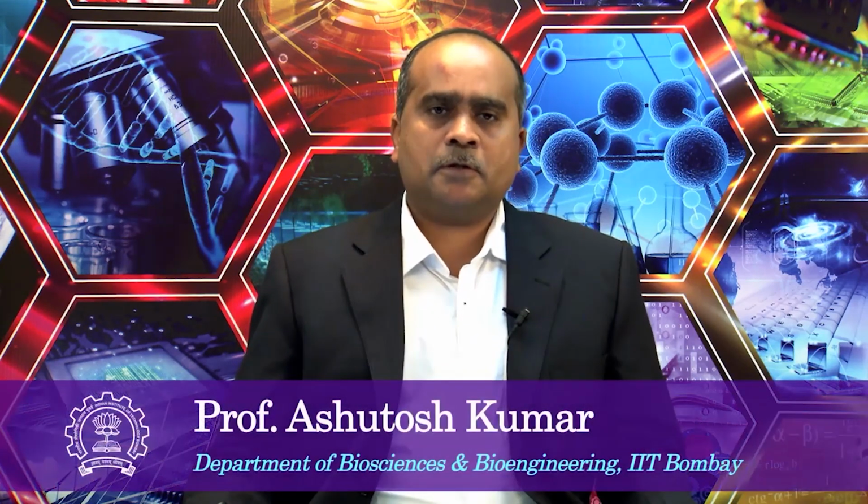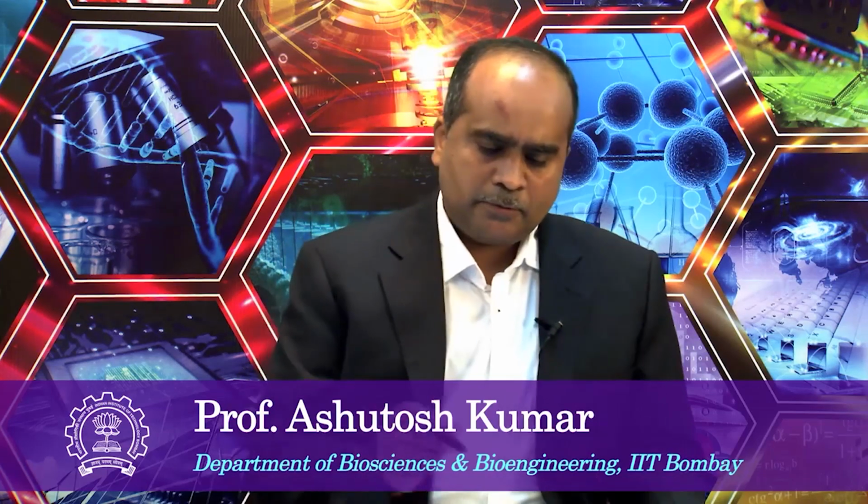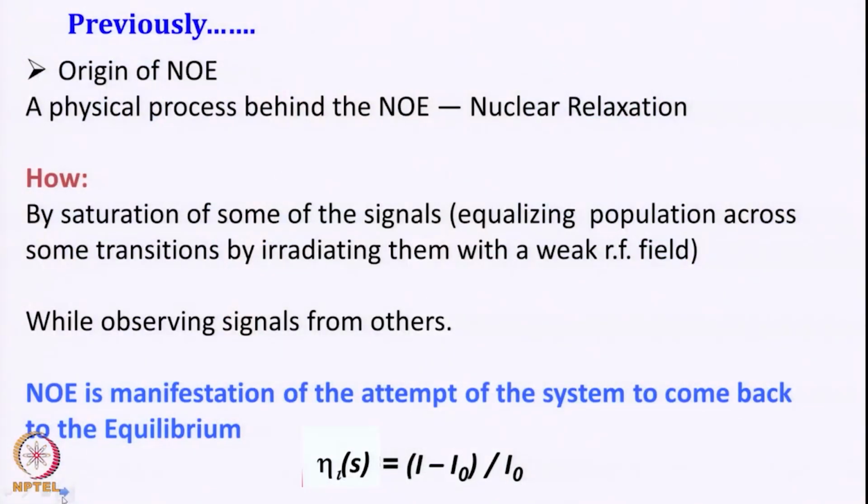Welcome to today's class. We were discussing polarization transfer, and today we will focus on how we can measure distance using NOE. So, we will connect the concept of distance and NOE in this class. Previously, we explained the origin of NOE and the physical process behind it, and we said that it is nuclear relaxation which causes the nuclear Overhauser effect.